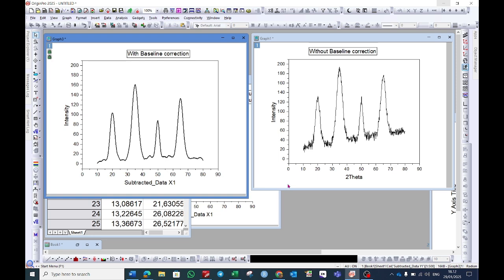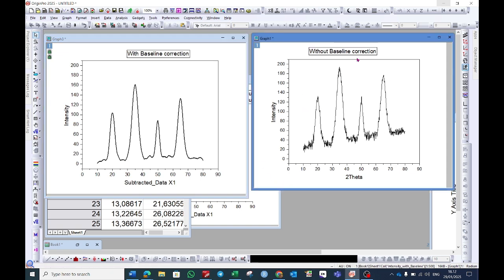Hello everyone. Today we will see how to make a baseline correction to any of your XRD, FTIR, or any other graph. Here I have a graph which is without the baseline correction. As you can see, the graph is going upward and there is no baseline correction here. This is the graph that will appear at the end of the video after the baseline correction. So let's begin.